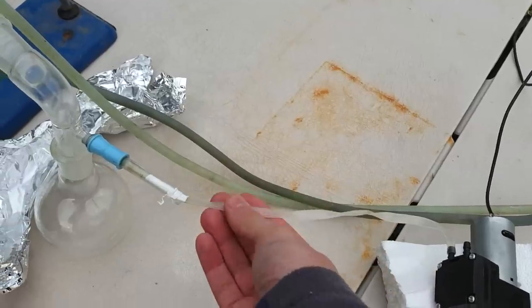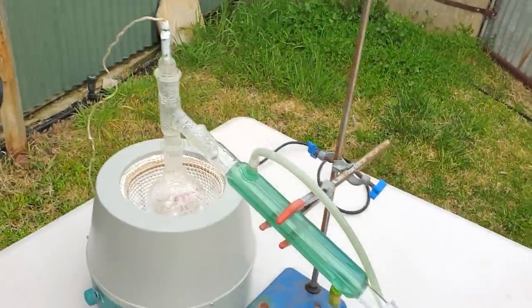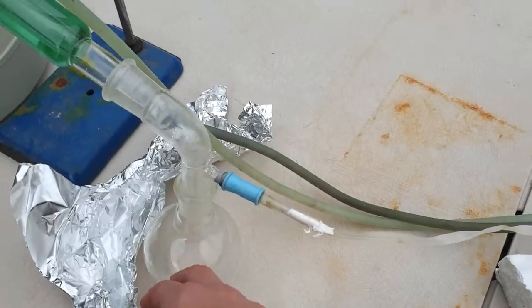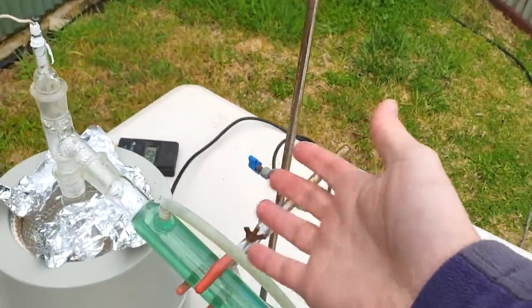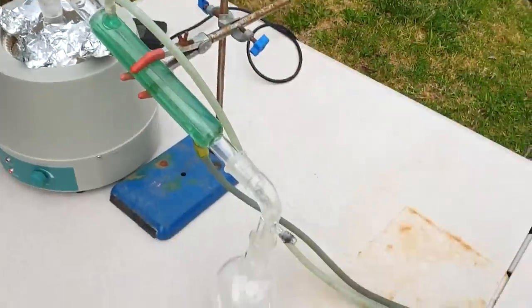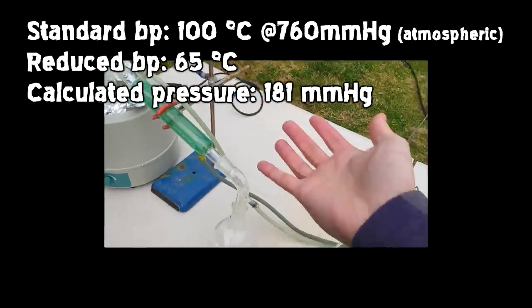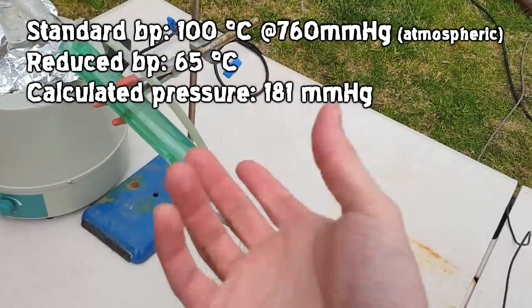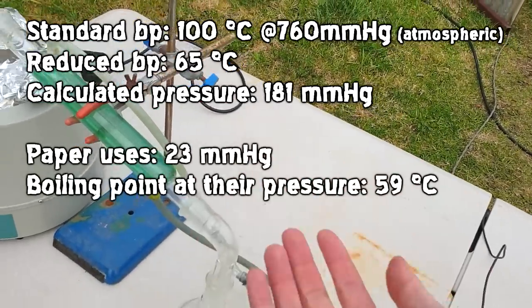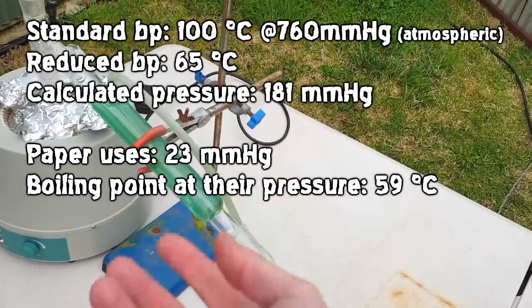Probably get better pressures out if we use a different line here, but this might be enough, at least this way it's not getting water through the pump. But boiling at 65 degrees means our pressure inside the system is 181 millimeters of mercury. What the fuck, 181 millimeters of mercury. The paper uses, I think, about 23 millimeters of mercury, and the boiling point of the compound is 59 to 60 something degrees.